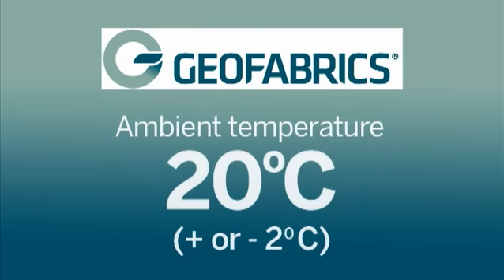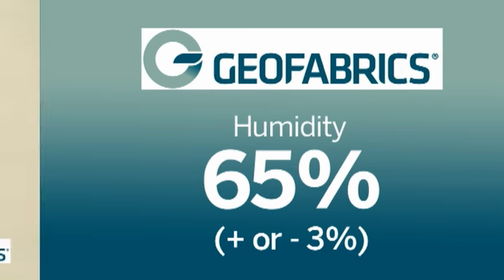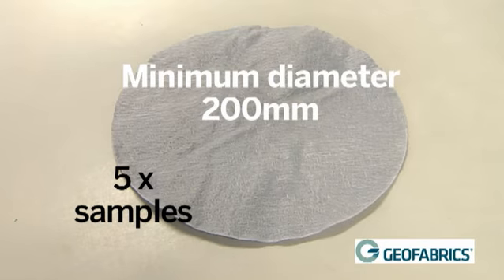The standard environment for this test method is an ambient temperature of 20 degrees Celsius, plus or minus 2 degrees Celsius, and humidity of 65%, plus or minus 3%. 5 circular specimens are required with a minimum diameter of 200 millimetres. Sometimes 10 specimens are tested according to customer requirements.